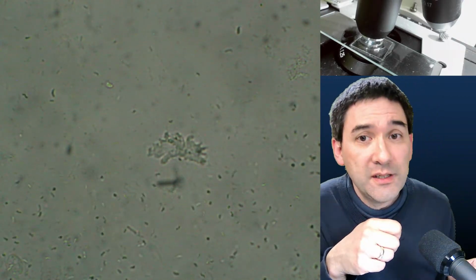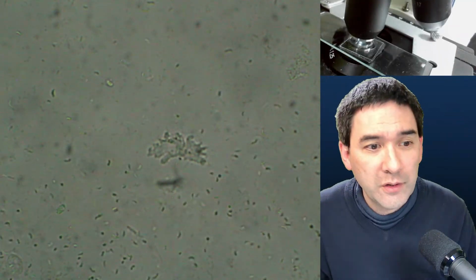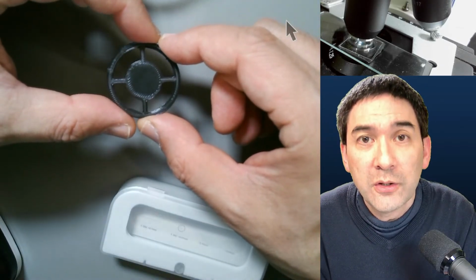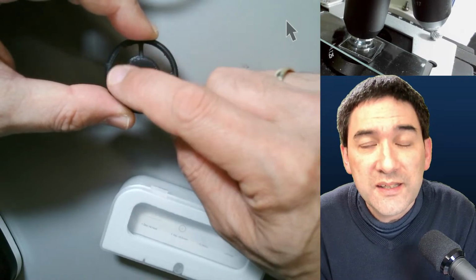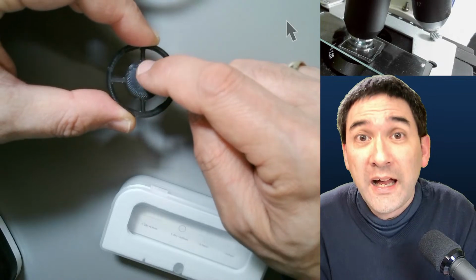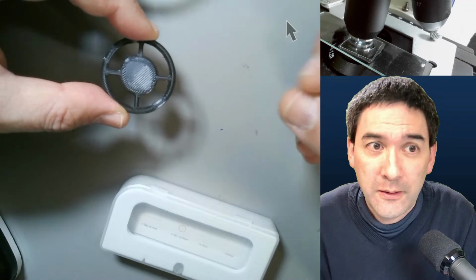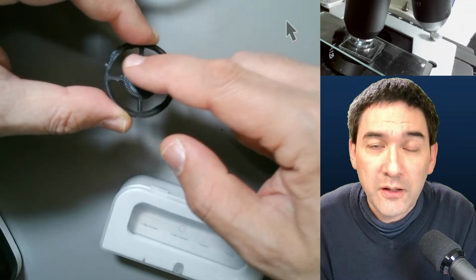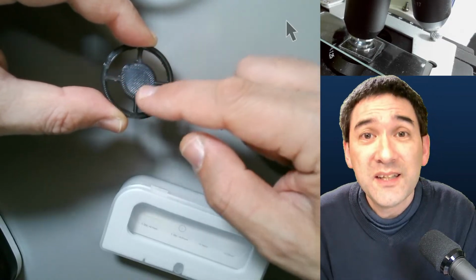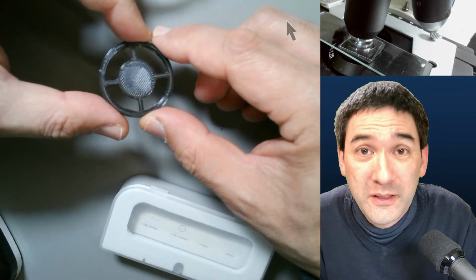Because what we've seen here is we're going up with the magnification, and I just have to show you here, very briefly. If we are using a higher magnification in order to get a darker background, we need to increase the size of the disk in the center. So the higher the magnification, the larger the disk in the center, and we already have less light. So there are two factors that take away light. If we do not have a sufficiently large disk in the center, then the background won't be dark. And that's a disadvantage. So dark field only practically works well maybe up to 20 or 40 times.